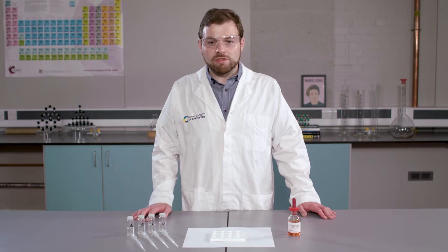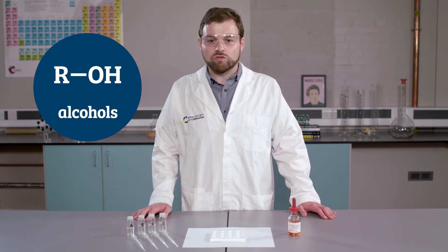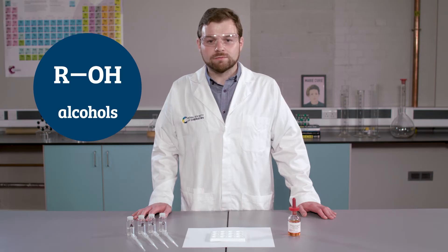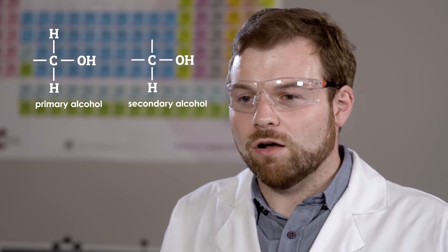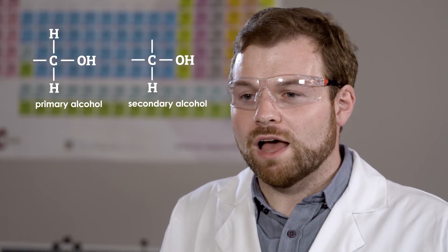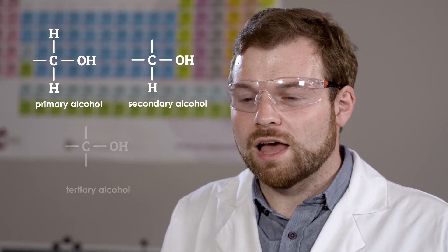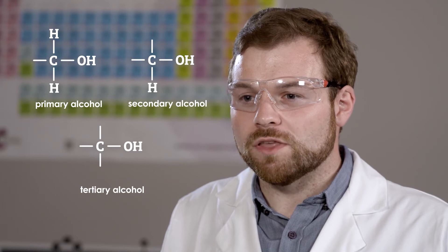Now I am going to test for the presence of an alcohol or OH functional group. Alcohols can exist as several different isomers, depending on where the OH group lies on the chain of carbon atoms. They are classified as either primary, secondary or tertiary alcohols. In a primary alcohol, the carbon with the OH group has either 2 or 3 hydrogen atoms attached. In a secondary alcohol, the carbon atom with the OH group has 1 hydrogen atom attached. And in a tertiary alcohol, there are no hydrogen atoms attached to the carbon with the OH group.